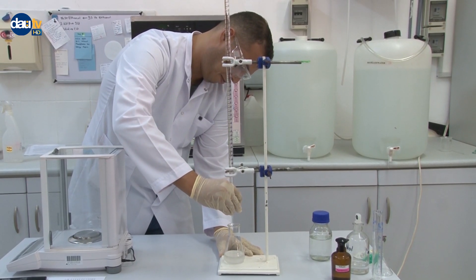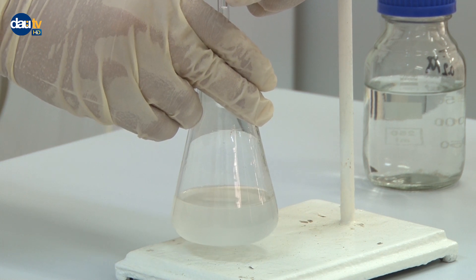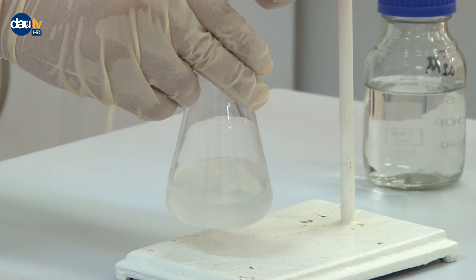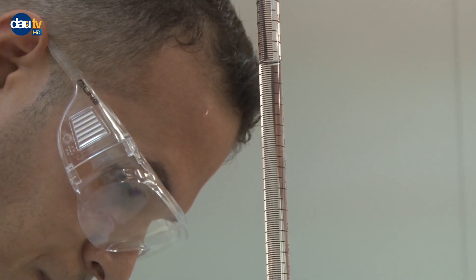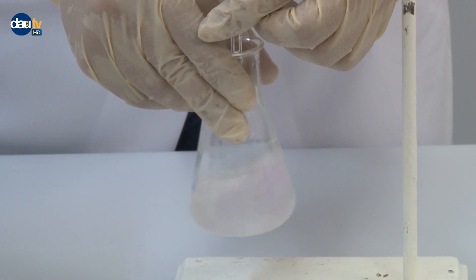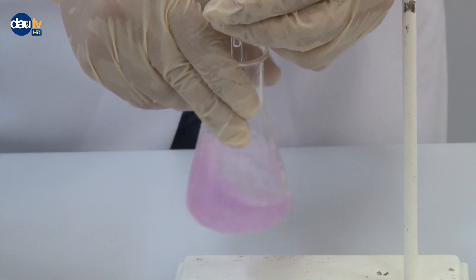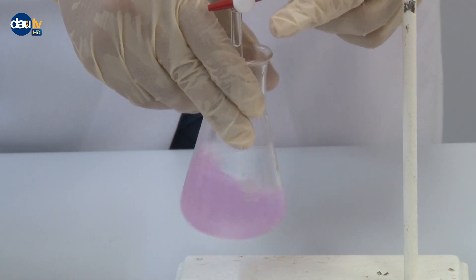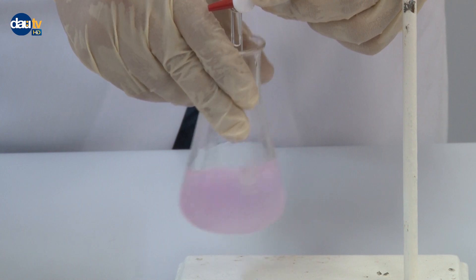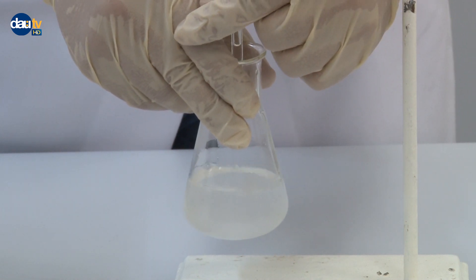Slowly titrate the aspirin by adding sodium hydroxide solution from the burette drop by drop while shaking the Erlenmeyer flask gently. Be careful not to lose the solution by harsh shaking, resulting in spills. Continue adding sodium hydroxide solution until a permanent color change to pink is observed. Keep in mind that you may observe the pink color for every drop, but this color will disappear by shaking well before the end point.